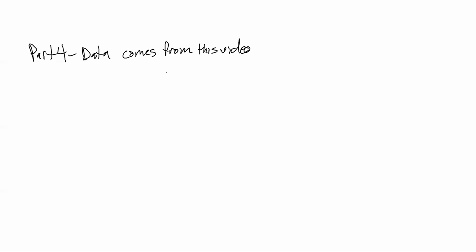And so I'm going to explain what you are going to see for your different ones. I'm going to give you the observations, and then you have to do the interpretations for them. That's going to be up to you to make sure that you interpret these correctly, so you can write out your data for them. So this is going to be for part 4.